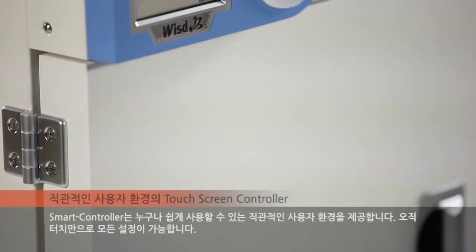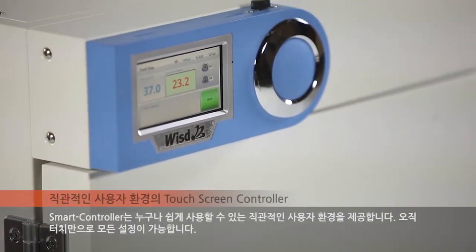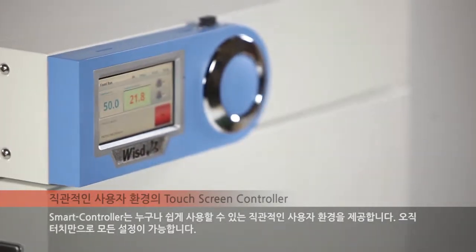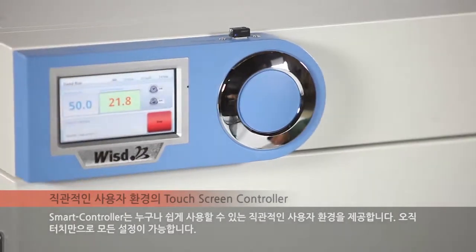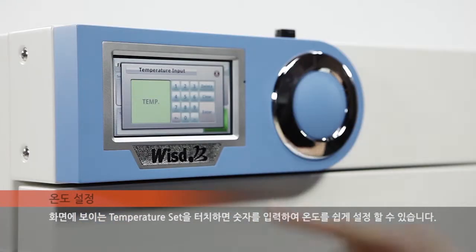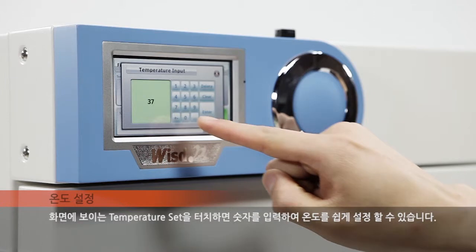The smart controller offers an intuitive user environment that can be used easily by anyone. All settings are made possible by a simple touch. Touch the temperature set button on screen to input values for easy temperature setting.